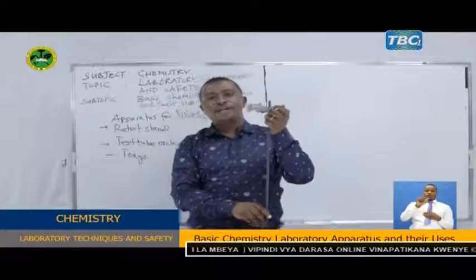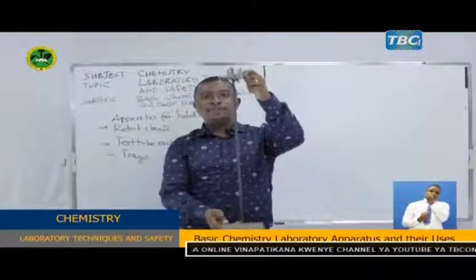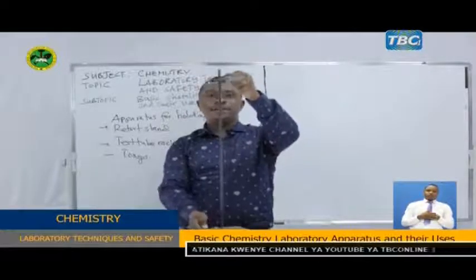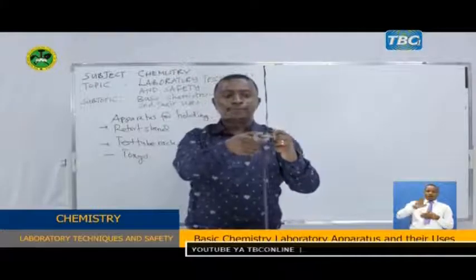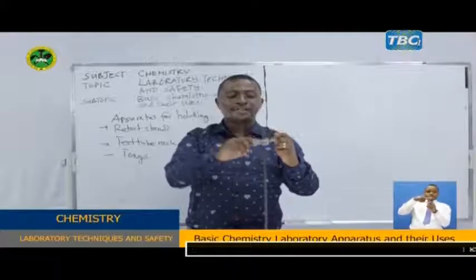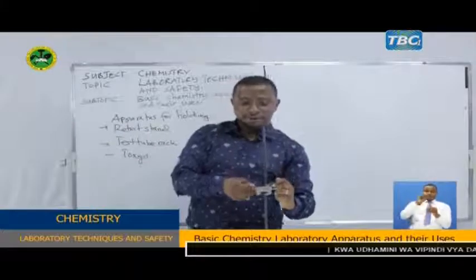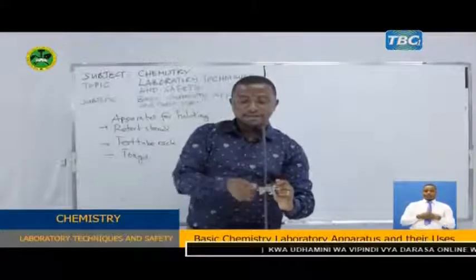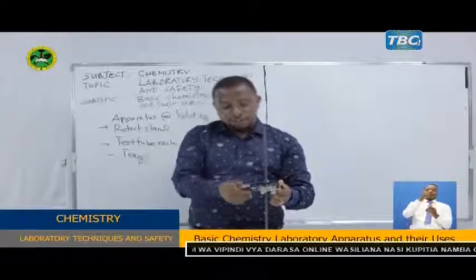This is known as a retort stand. You can see it here. It has a clamp that can be adjusted to certain desirable levels.